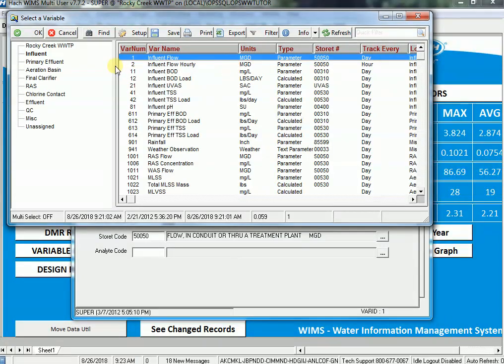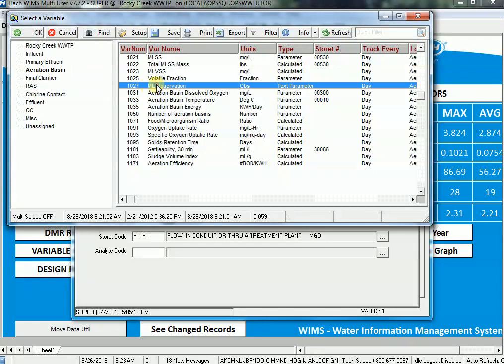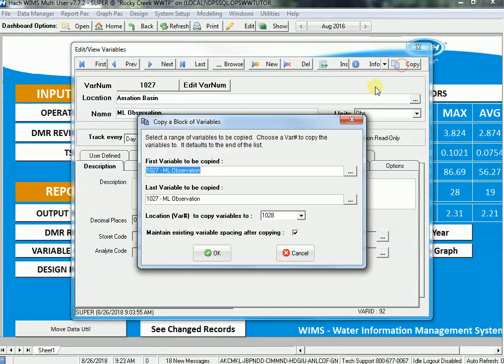I'm going to browse and decide where I'm going to put it. I'll go to Aeration Basin and put it next to my observation. I'm going to bring that variable up because it's easiest to copy it to create a new variable, so I'll say copy.